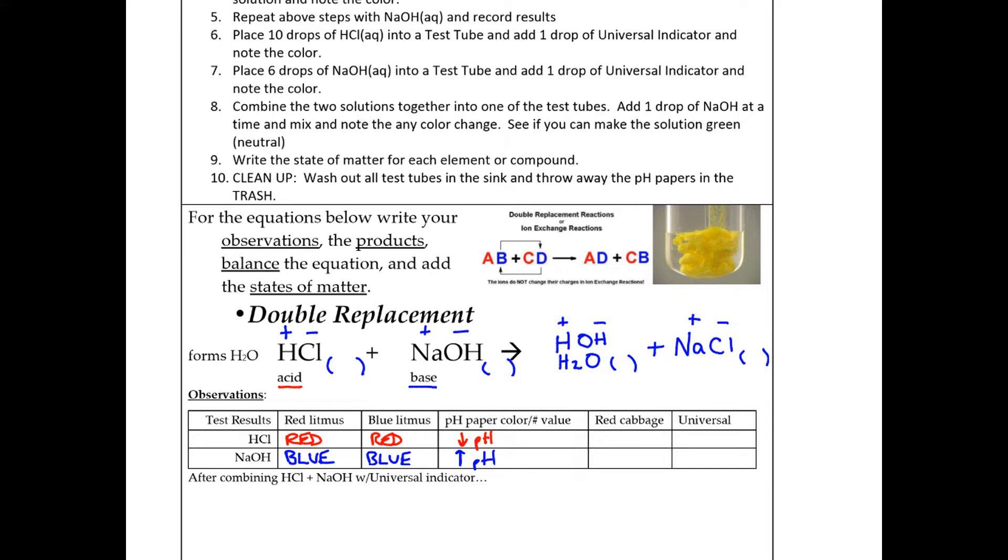So on the acid side, you're going to be from ROYGBIV, the rainbow colors. You know that red is one end of the rainbow. And then we're going to have the other end of the rainbow is violet. And so this should have been really close to a violet or bluish color because of that end of the rainbow. So you will see the color change in the indicator as this happens.